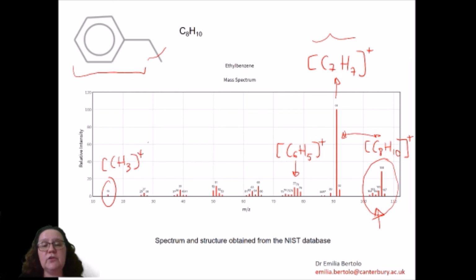But in general, I would suggest staying with the largest, tallest peaks, and at higher mass to charge ratios, because you can find very, very small fragments in the lower section of the mass to charge ratio axis.